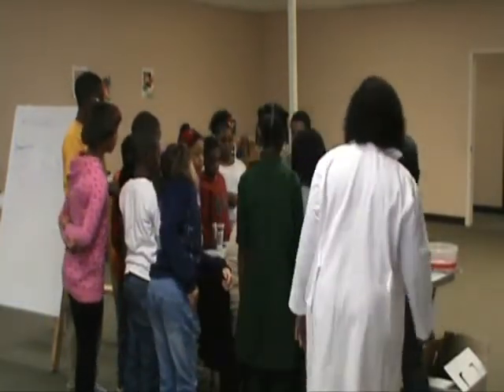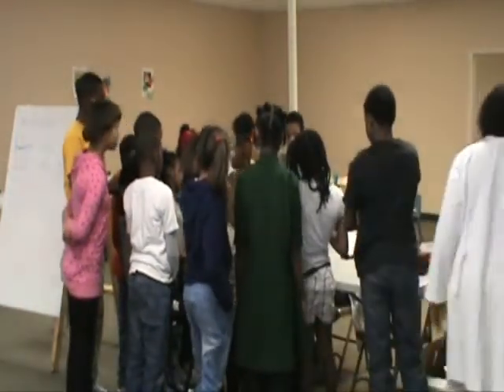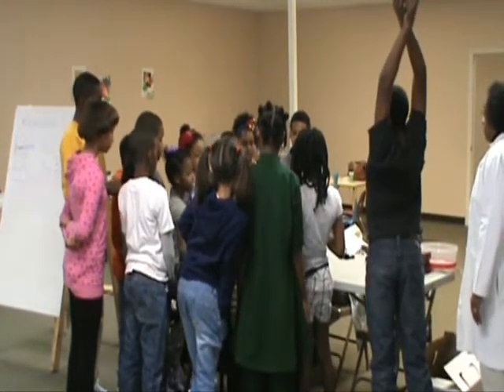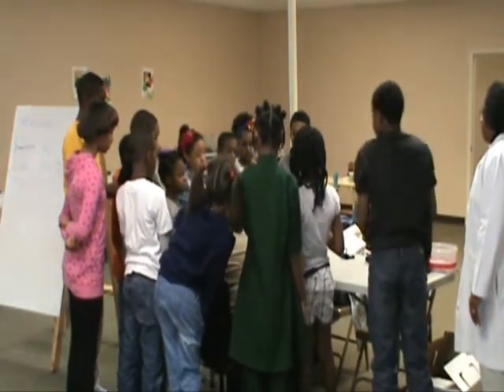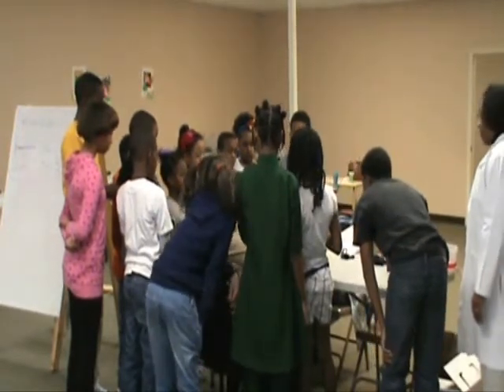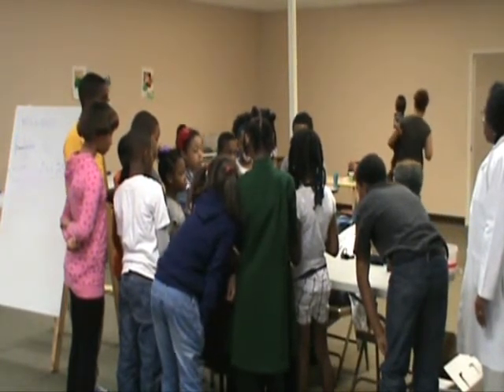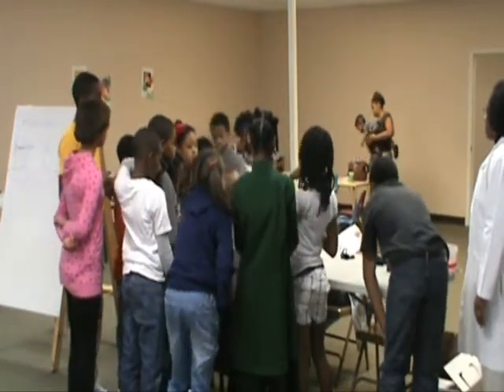Okay, now, always start at your lowest, 10. Well, he weighs more than 10. Does he weigh 20 something? Nope, still above. Does he weigh 30? Does he weigh 40? Look, he's between 30 and 40.